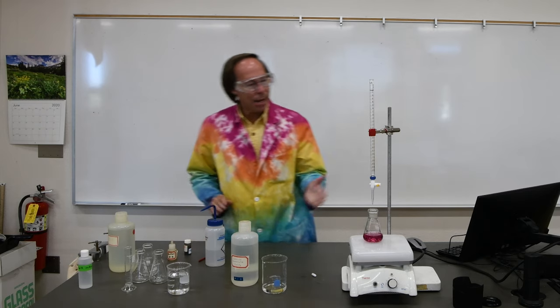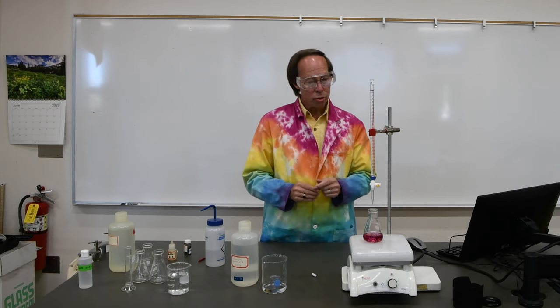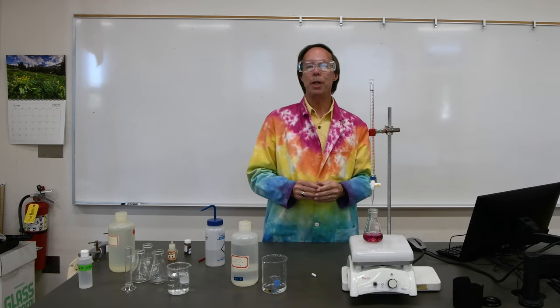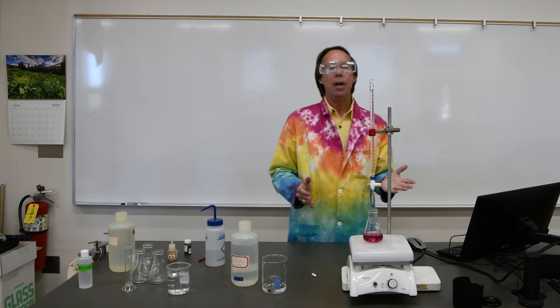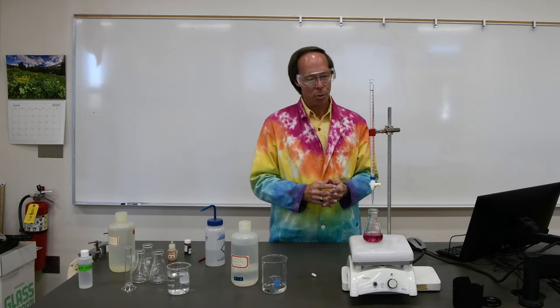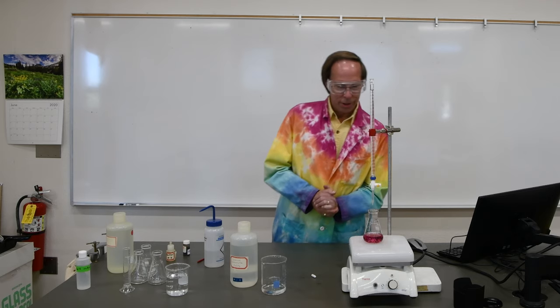We're now going to add to that our EDTA solution until it just turns blue, and then we can take a reading from our burette and we'll be able to determine the amount of EDTA required and thus the hardness of the water. Now we're ready to begin our titration.